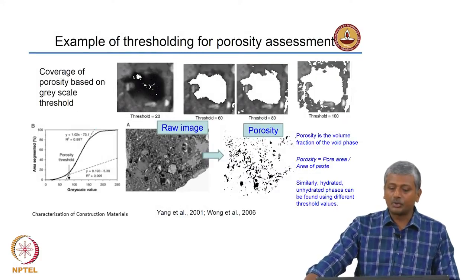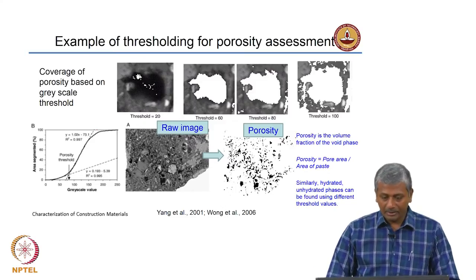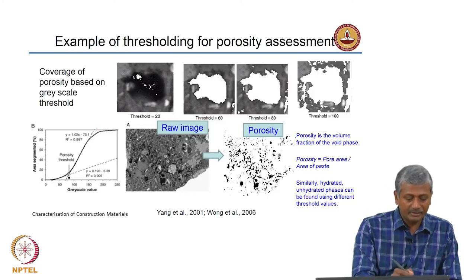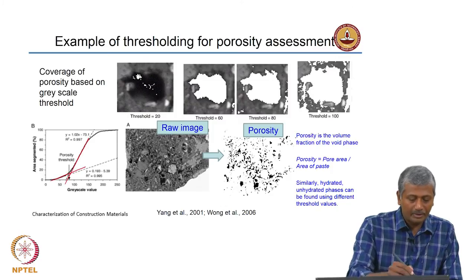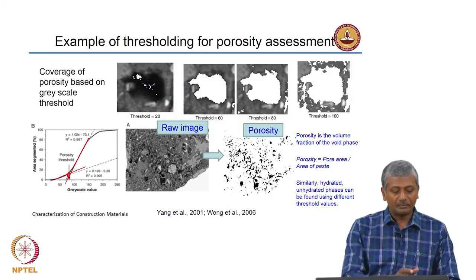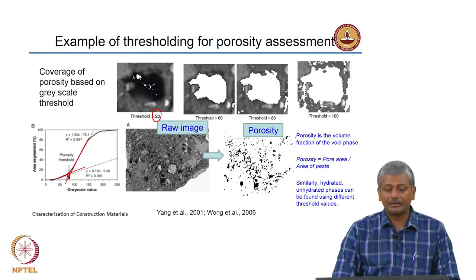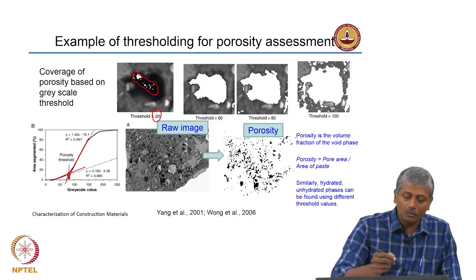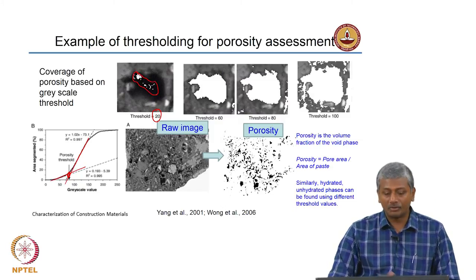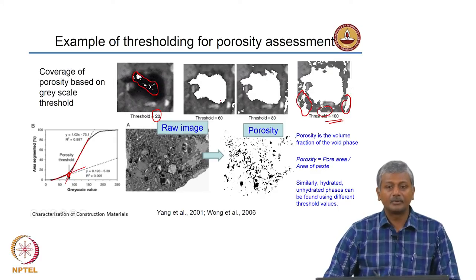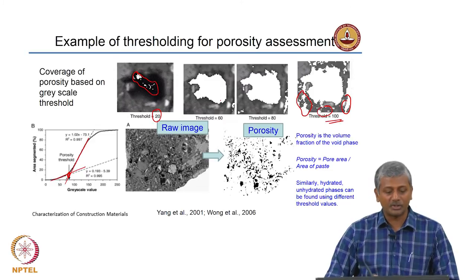This is thresholding for porosity assessment done in a slightly different manner. The coverage of porosity is based on greyscale threshold — the tangent is taken here and the porosity threshold is determined between 50 and 100 in this case. When the threshold is 20 you are only capturing a small part of your void. When the threshold is 60 you are capturing most of the void, but if the threshold is 100 you are also capturing other points outside the void that may not be part of it. You can go completely wrong if you do not do a proper thresholding operation.